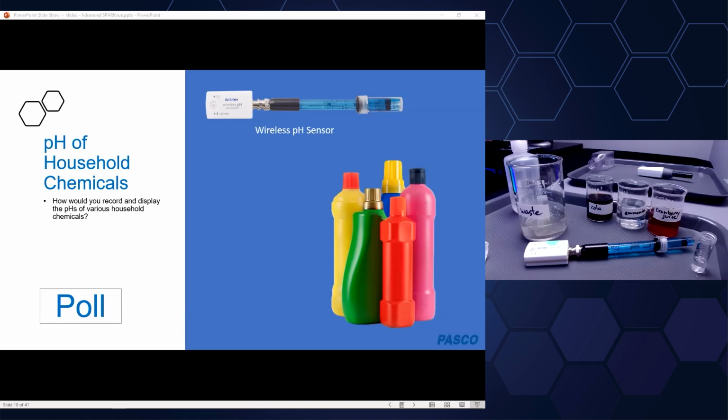And others of you, a couple of you had some other thoughts. All right. Margareta asks, do we need to wash the pH meter between different chemicals? Indeed we do, so we'll be doing that between each chemical. That's an important consideration here.